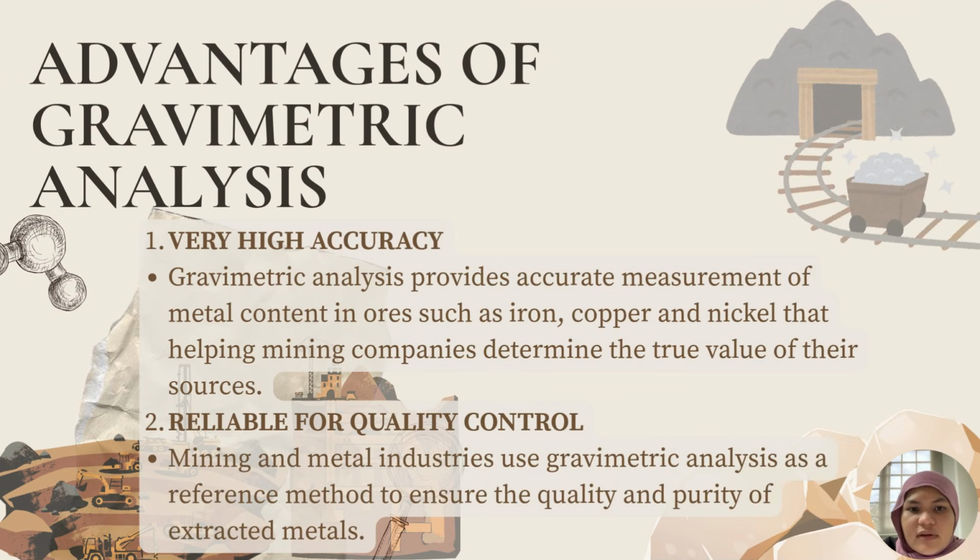For the advantages of gravimetric analysis. First, we have very high accuracy. Gravimetric analysis provides accurate measurement of the metal contents in the ore, such as iron, copper, and nickel, helping mining companies to determine the true value of their source.